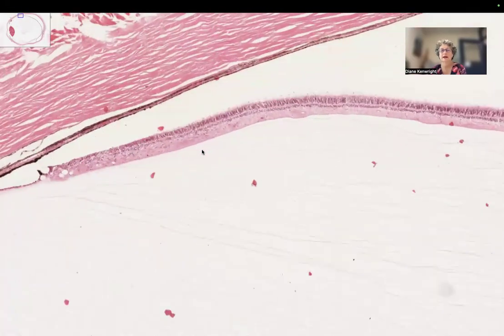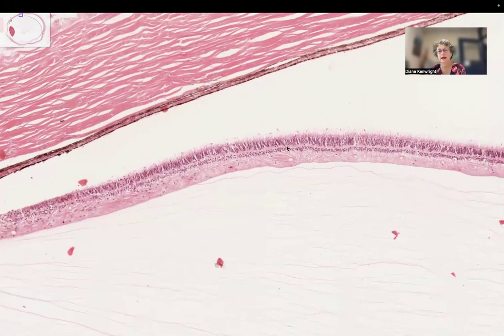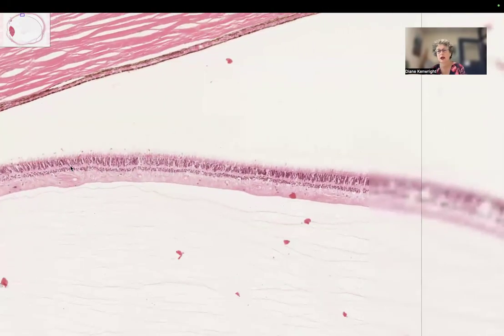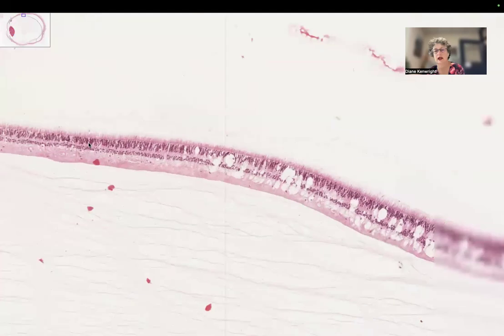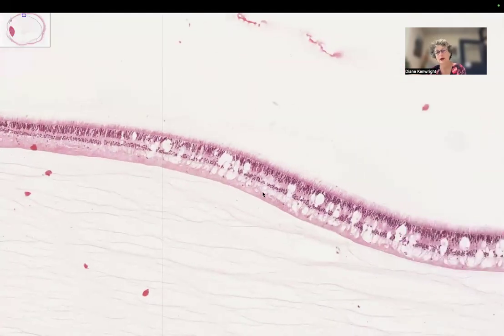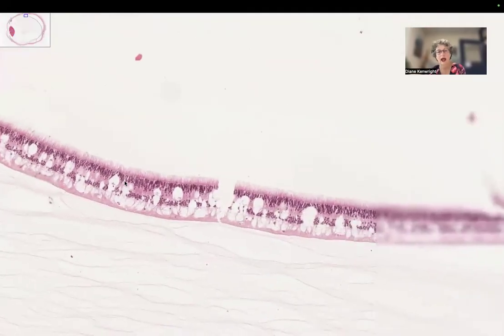So we can see that this is an artifactual separation because the photoreceptors are preserved. They've just been pulled off. The choroid is looking okay in these pictures. So it's a diabetic eye, so we want to look for signs of diabetes or in particular laser treatment in the back of the eye. I haven't seen anything yet. We are getting some edema here posteriorly. That's what's causing these vacuoles. And of course, what we're also getting is the absence of the ganglion cell layer.